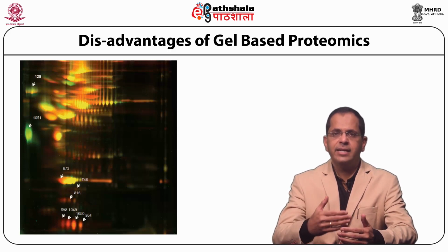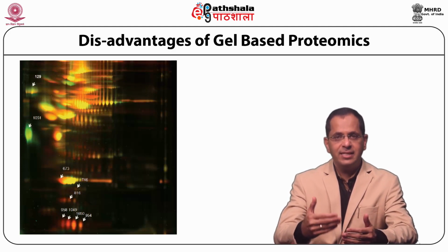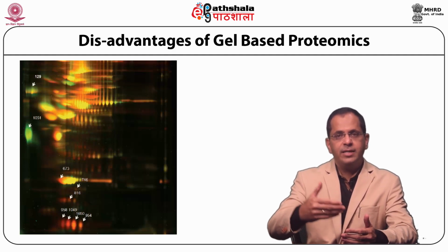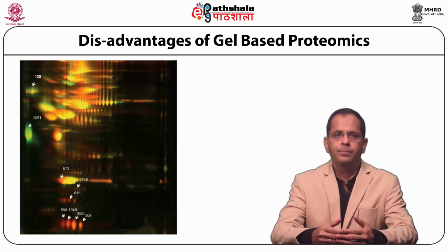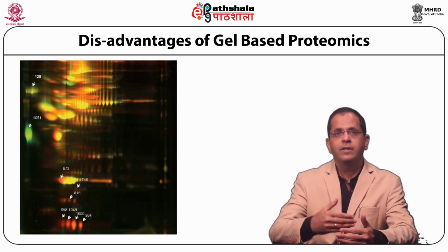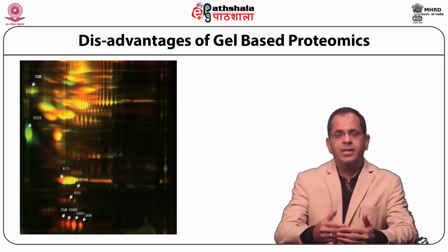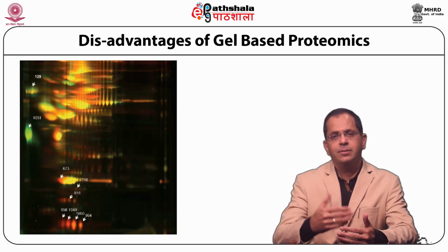Proteomic profiling is an experimental platform to map all the proteins expressed in a given phenotype, and the differential expression compares the protein profile in two or more phenotypic states. When we talk about clinical proteomics, it includes the proteomic analysis of human body tissues. Towards this, there are two effective techniques. They are gel based proteomics and non-gel based proteomics.